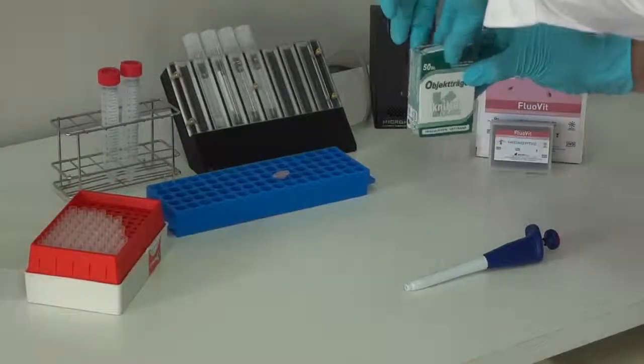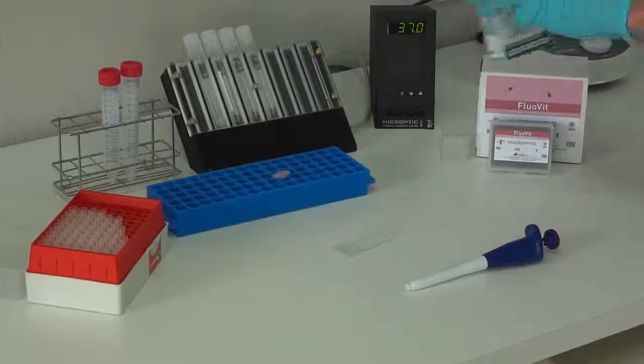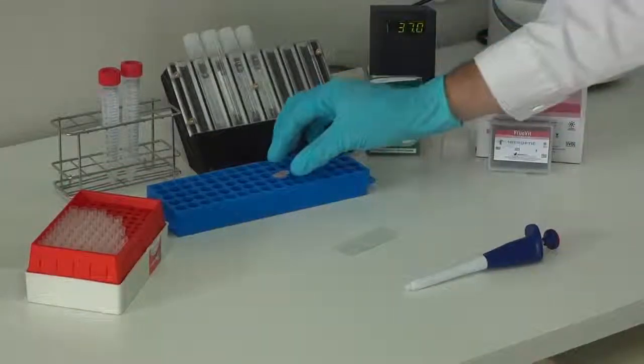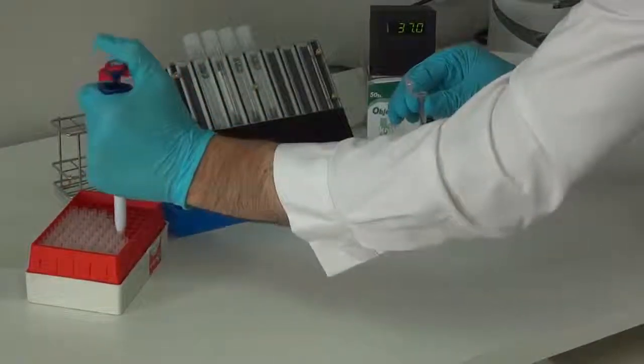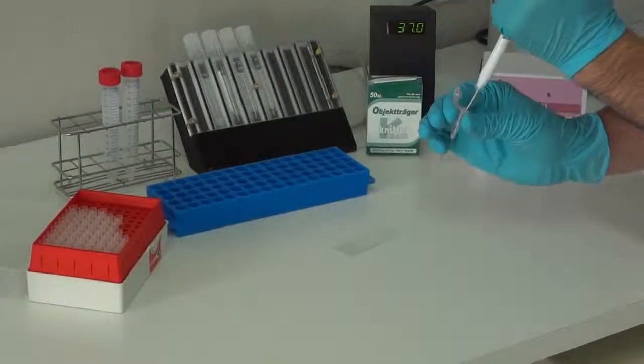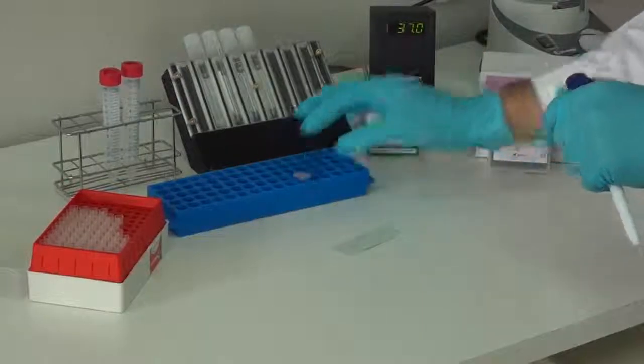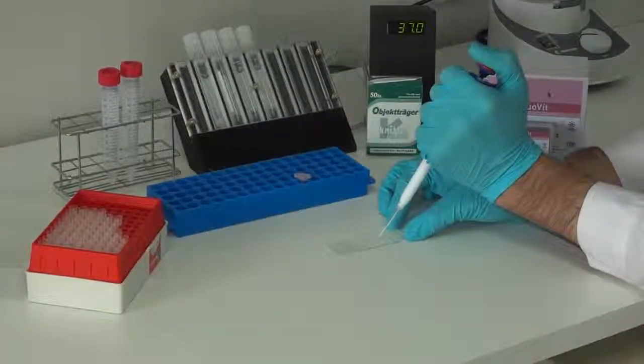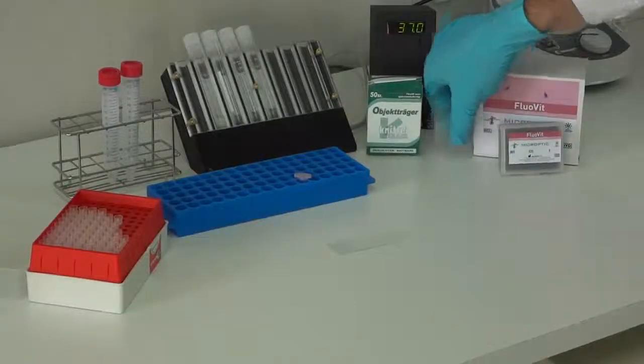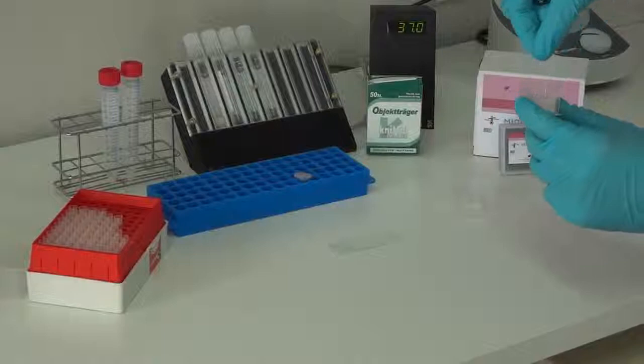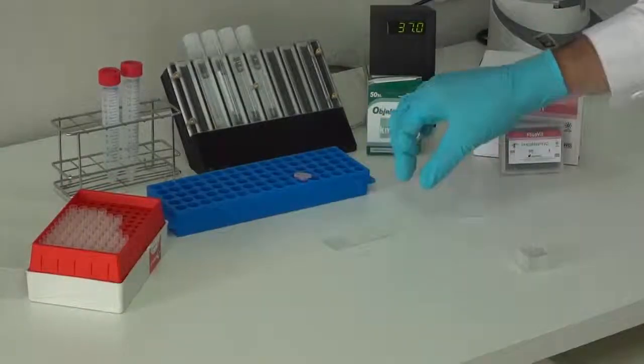Last step is to put a small aliquot of 10 microliters of stained sample on a standard slide. Cover with cover glass and the slide is ready to be analyzed under fluorescence.